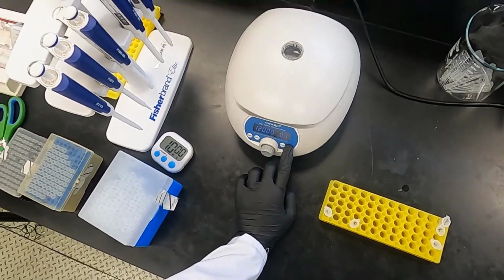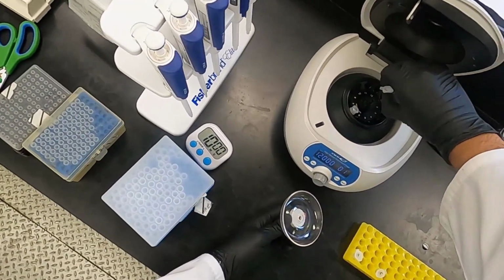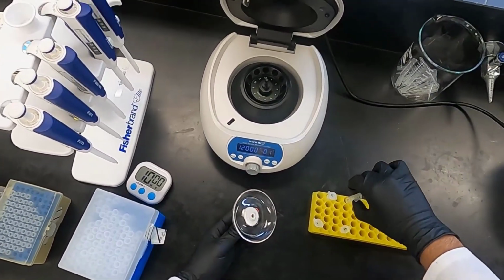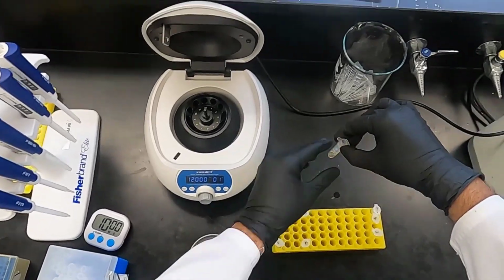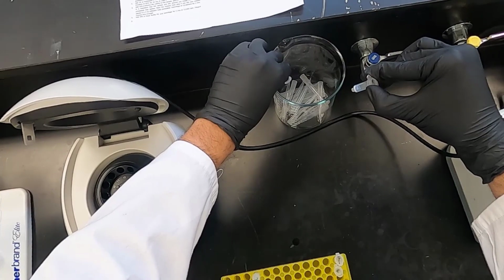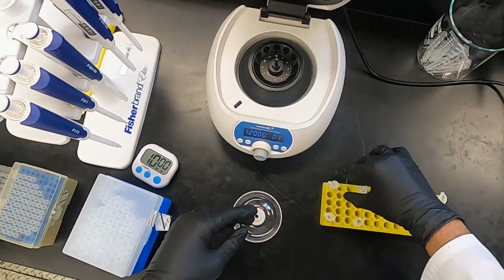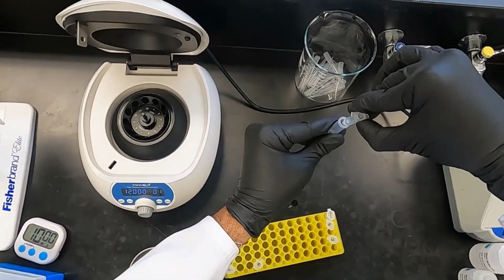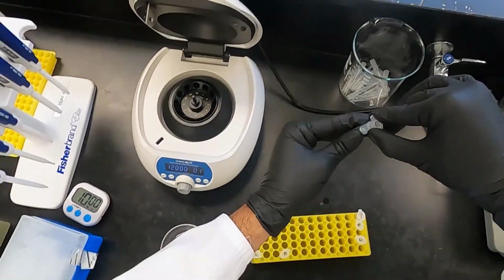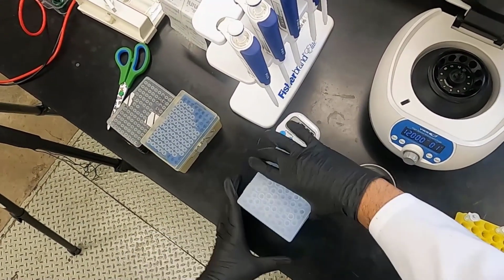Now that we've spun them for 1 minute, we're going to collect our spin tubes here. The flow through is not what we want, so we're going to discard the flow through. You can simply do that by removing the column, making sure not to make contact with the flow through. And we're going to repeat this step again to collect the remainder of our sample. So again, we're going to load this up for 500 microliters.